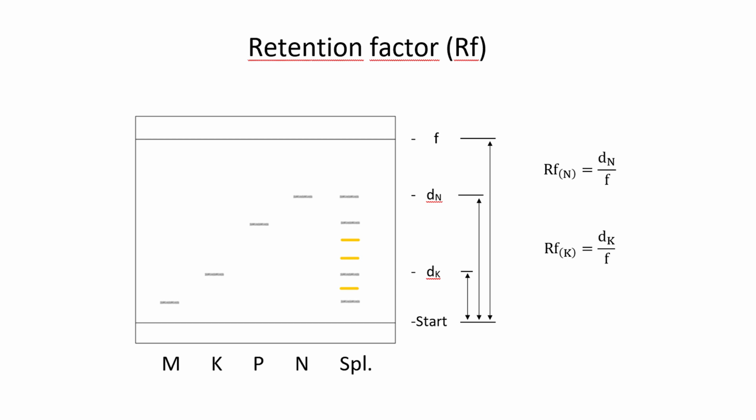For individual alkaloids, retention factors are calculated by dividing the distance traveled by each spot by the distance traveled by the mobile phase on the plate. The values of retention factors are between 0 and 1. The correspondence of the retention factors of the spots in the extracted sample and the spots of the standards indicates the presence of these alkaloids in the sample of poppy heads.